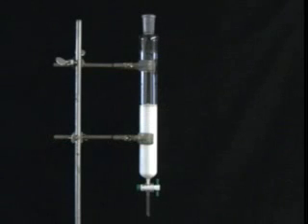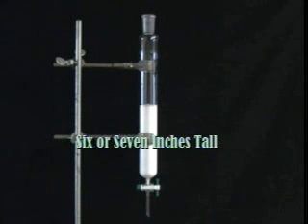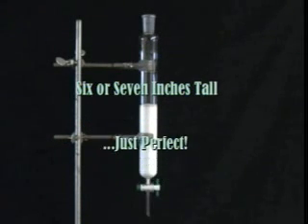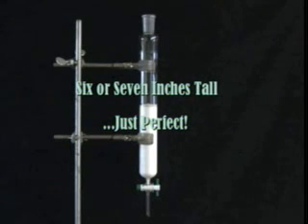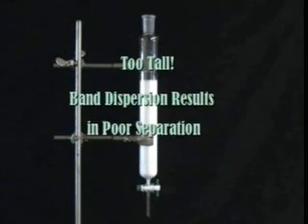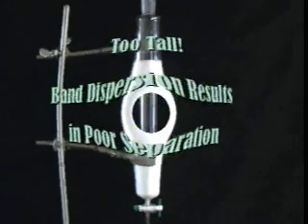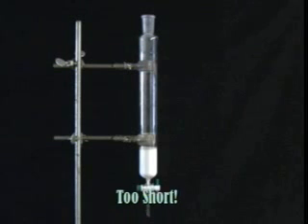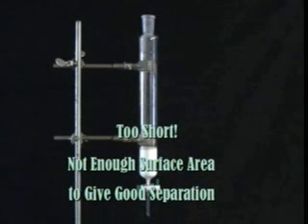The last major decision to make is what diameter of column to use. Different people have very different opinions about this, but in general, it is a good idea to choose a column that will fill 6 to 7 inches with the chosen amount of silica. In a taller column, the different bands of compounds will disperse and overlap. But a shorter column will not have enough surface area to give good separation.